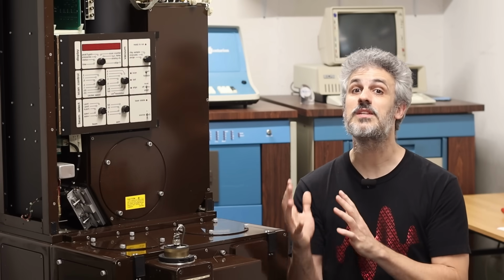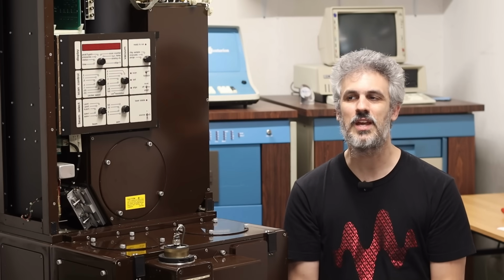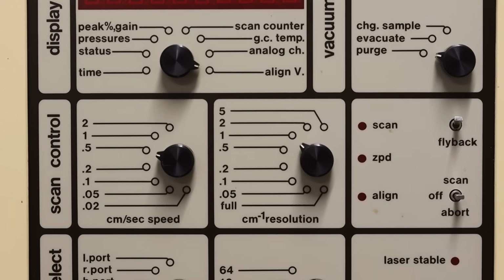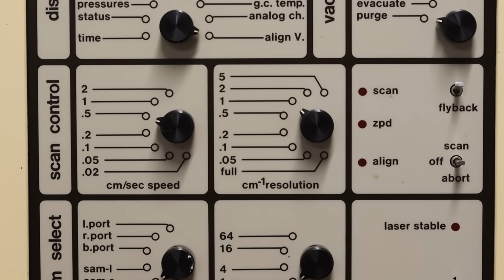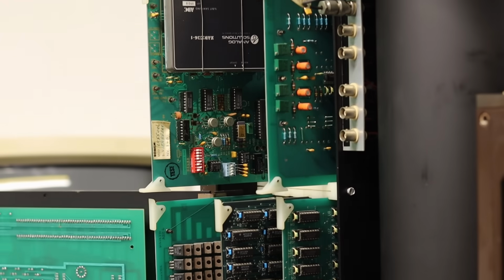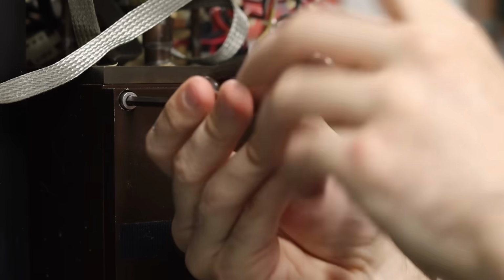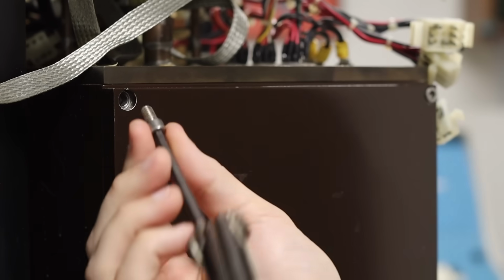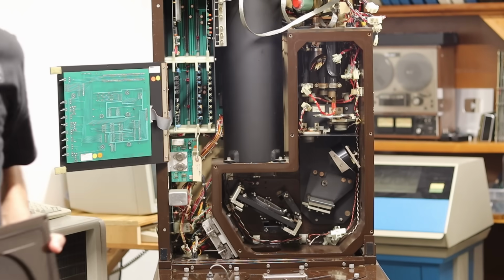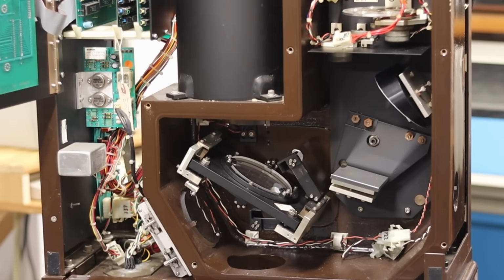Which is to say that this machine is not currently functional. It's a ran-when-parked type of thing, but it's going to take a little bit of work to get it back up and going. And in order to understand what's going on here, let's get this thing pretty far apart. This little front panel here with all these switches and knobs on it just swings right open, revealing a pretty full card cage of a bunch of PC cards. Then there's a massive front plate here that is held on with 7 screws. If we take all 7 of those screws out, that just pops free and we are greeted with an absolute mess of wizardry and mirrors.